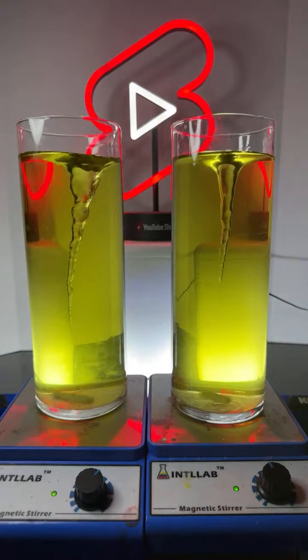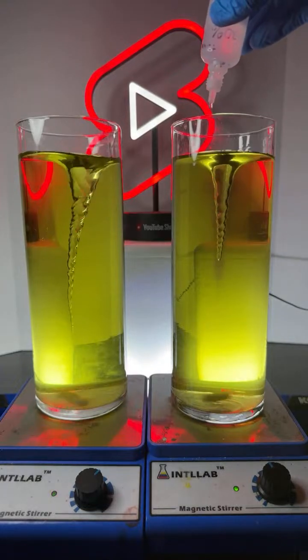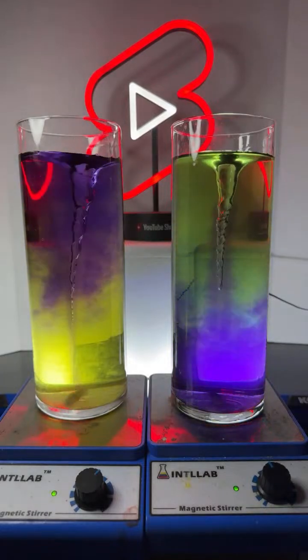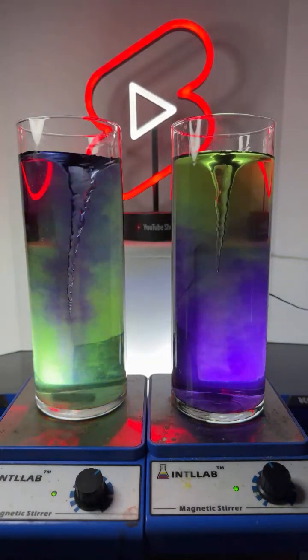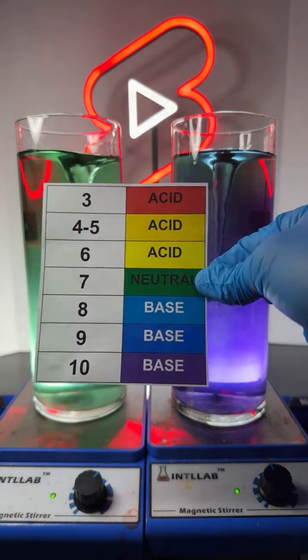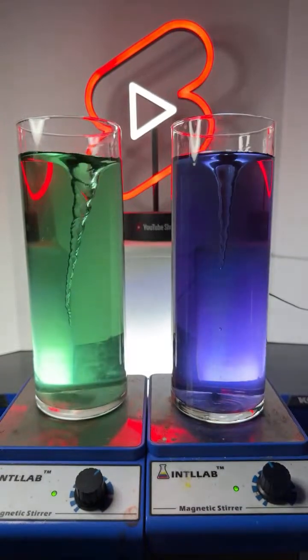Watch what happens when I add some base to both flasks. I'm adding a little bit of base over here on the right, a little base over here on the left, and you can see when I added the base, the color shifts to like a green or a blue. And so when you add base, the pH goes up. And when you add acid, which I'll do next, the pH will drop.